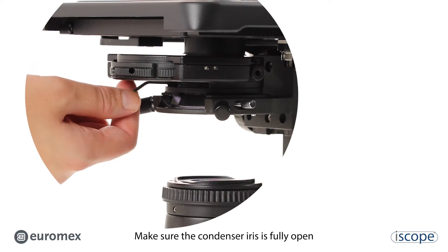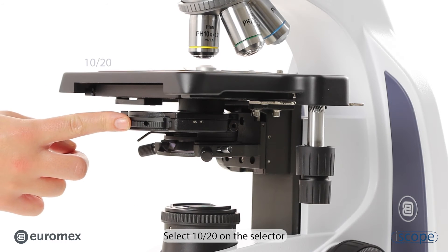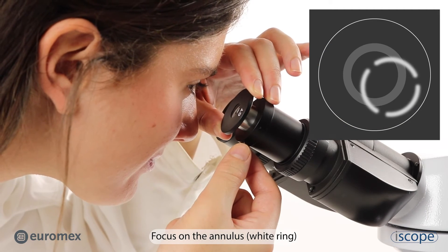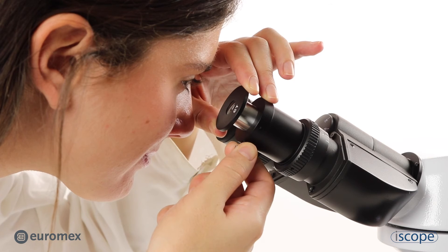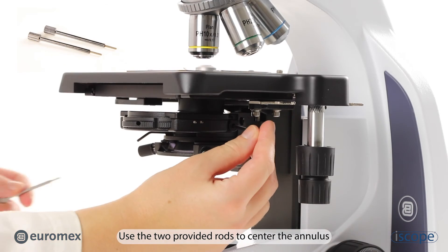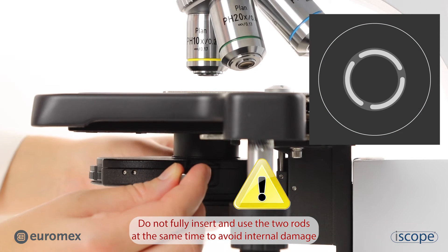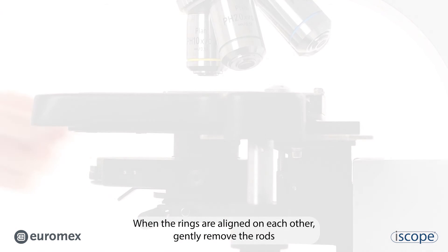Make sure the condenser iris is fully open. Select 10 to 20 on the selector. Focus on the annulus, the white ring. Use the two provided rods to center the annulus. Do not fully insert and use the two rods at the same time to avoid internal damage. When the rings are aligned on each other, gently remove the rods.